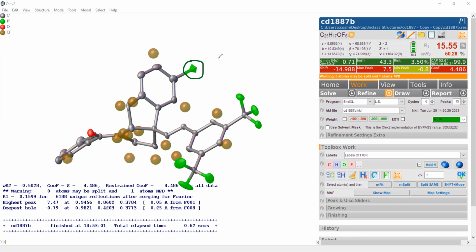So one thing you may want to do is ask, what element can we choose? Obviously, out of all the elements in our formula, fluorine is the heaviest one. So what we're going to do is first check what the bond distance is of this carbon-fluorine bond.